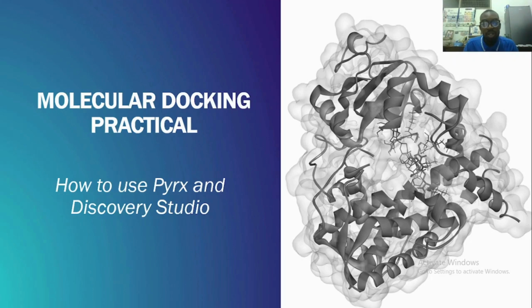Welcome. Today we'll be carrying out molecular docking, and instead of just discussing molecular docking, we'll be performing an actual experiment using PyRx and Discovery Studio. In the past, I've introduced molecular docking. I've also introduced PyRx, and I've told us some of the advantages of molecular docking. But today we're going to carry out a practical. Now, I think that helps a lot instead of just talking about it.